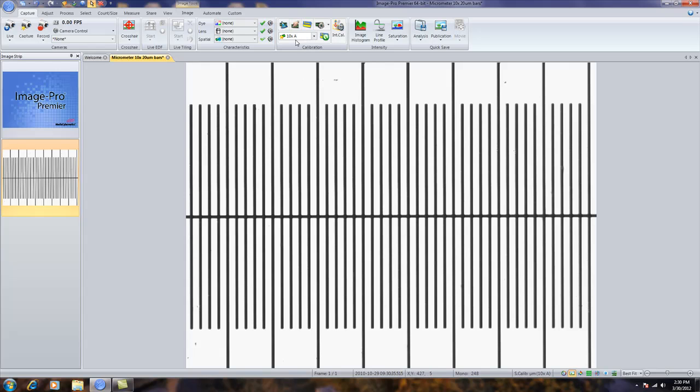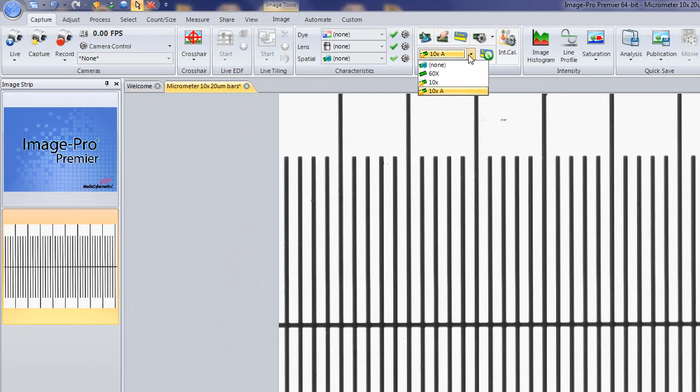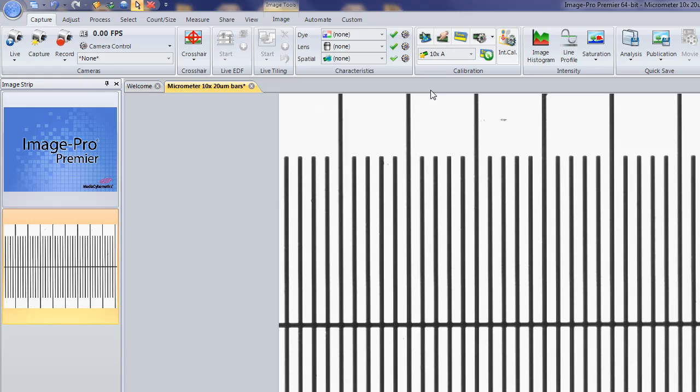And here in the dropdown, you'll see that's the calibration that's been applied. And here's my list of calibrations that I've created so far.